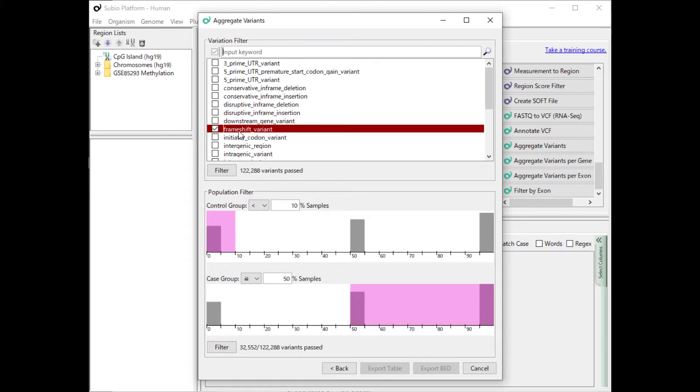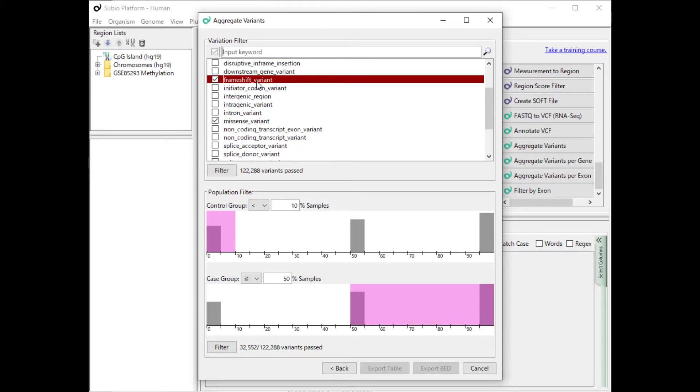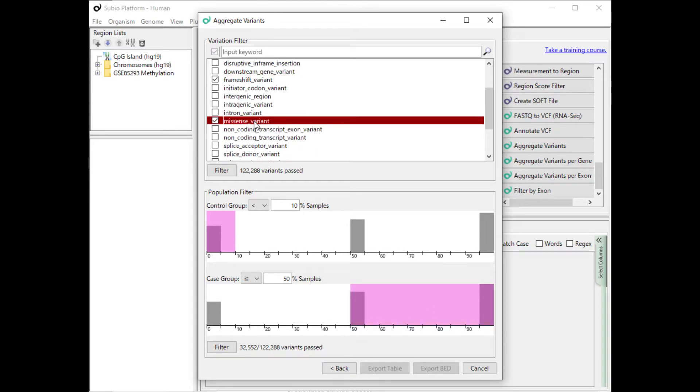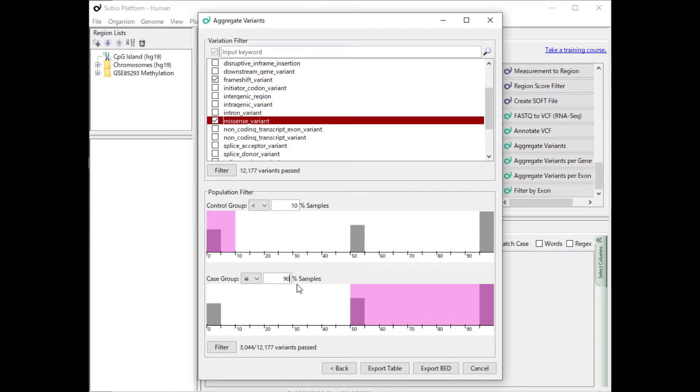Confirm that you check only the Missense and Frameshift variants, and press the Filter button. The bottom panel is for filtering by the frequency of occurrence in control group and case group.